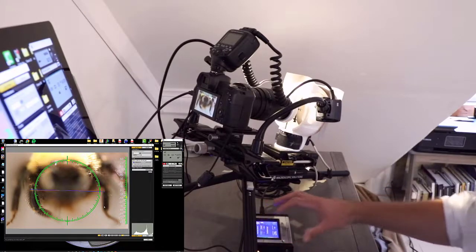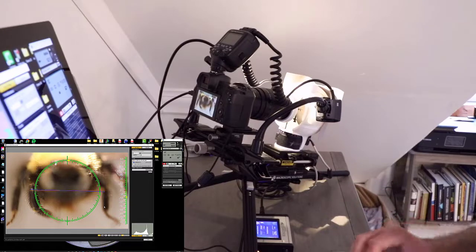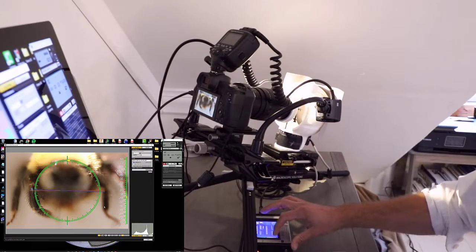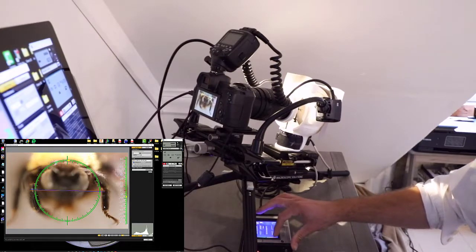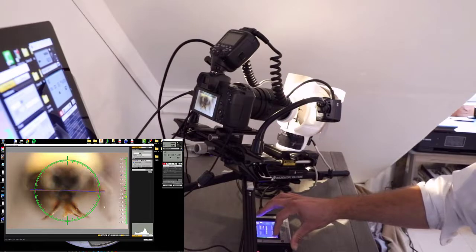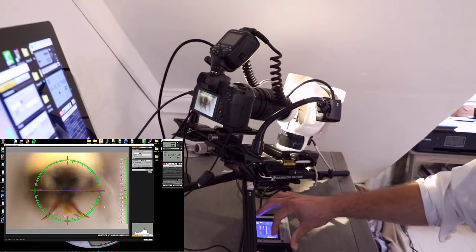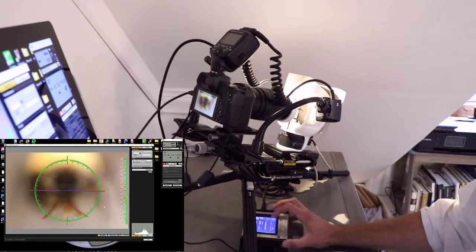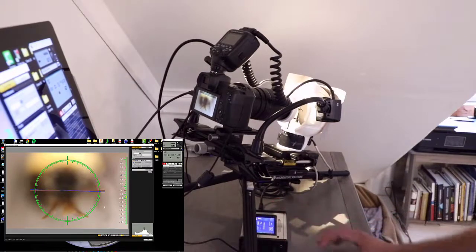There's also a lot of depth here. We're just doing a headshot. There's absolutely no reason to move past this point as a starting point. We don't need to go all the way to the end, just sort of a midsection, but we do want to make sure that as we move away from the specimen, our focal plane reaches just outside the foremost part of the specimen. So that's right there.